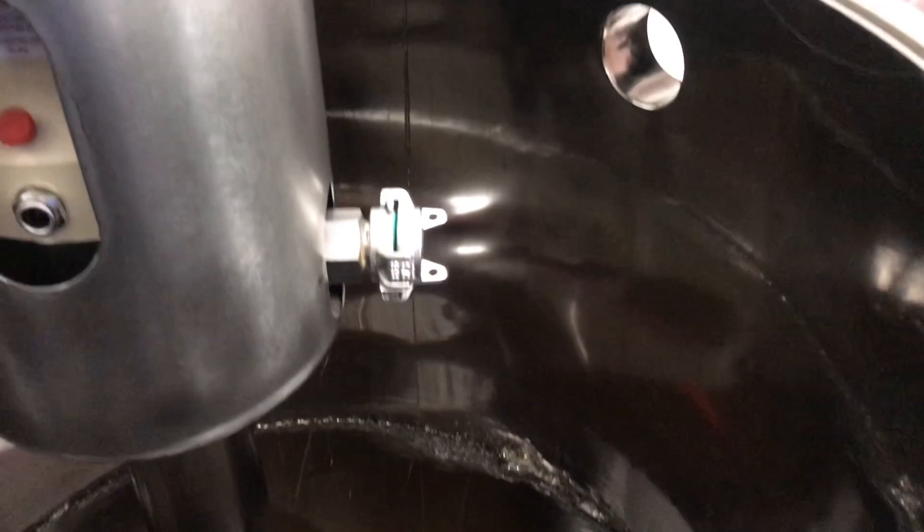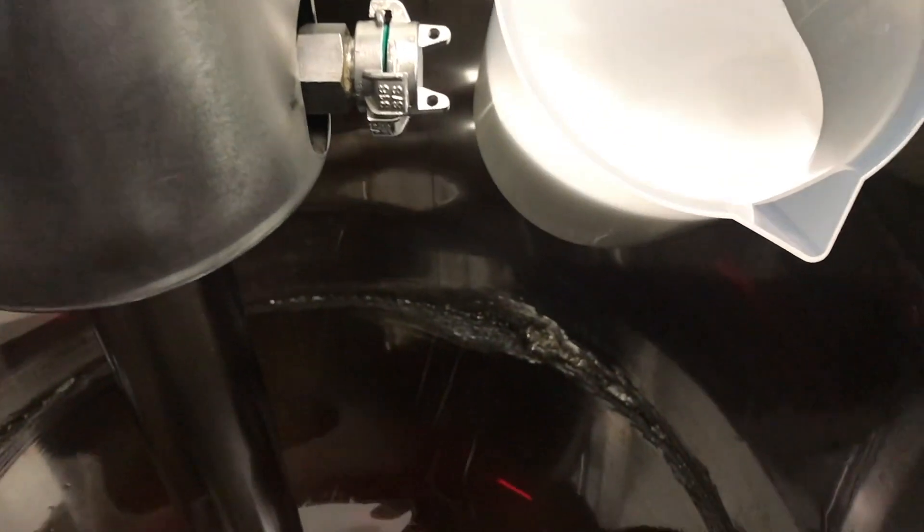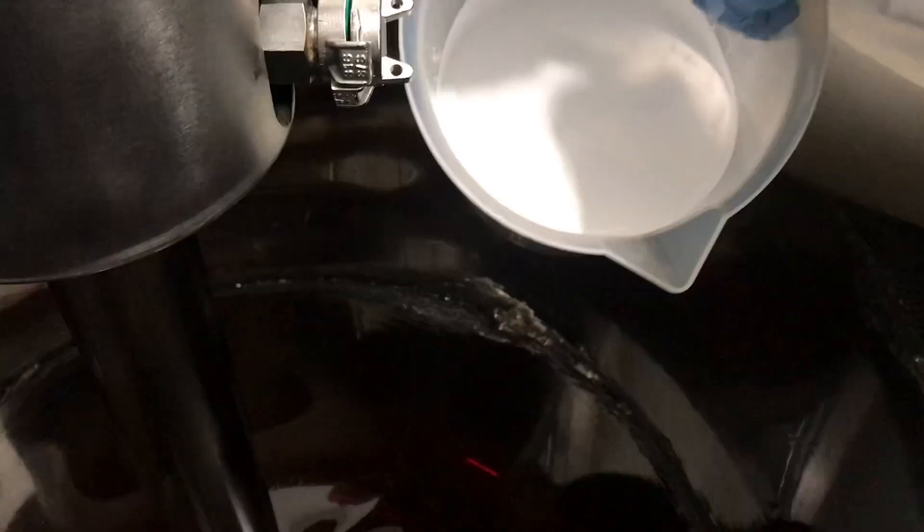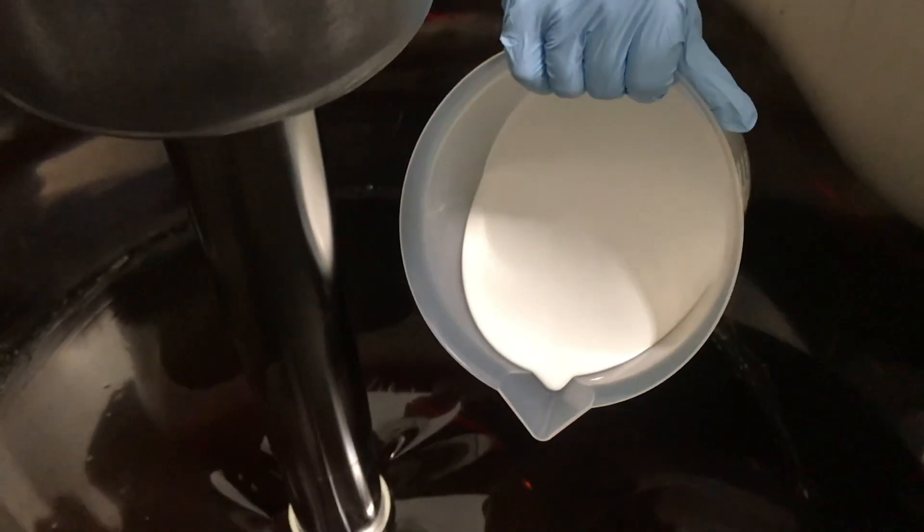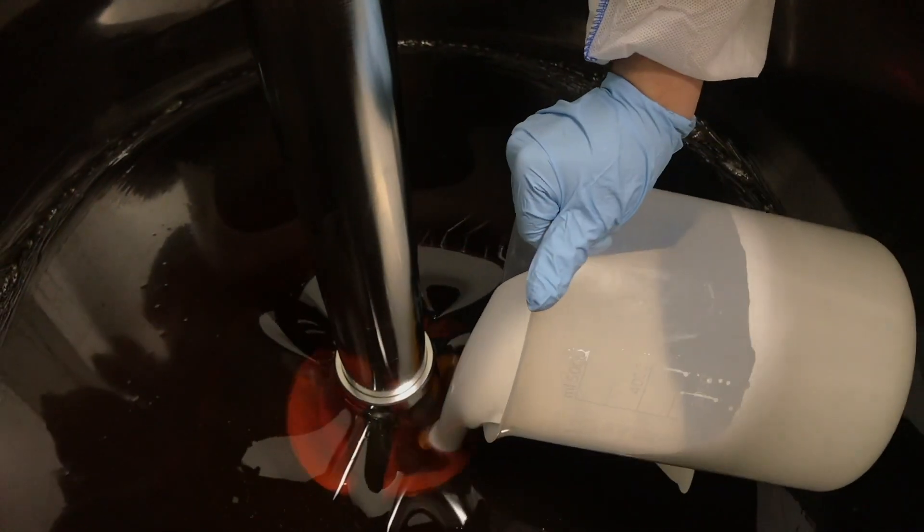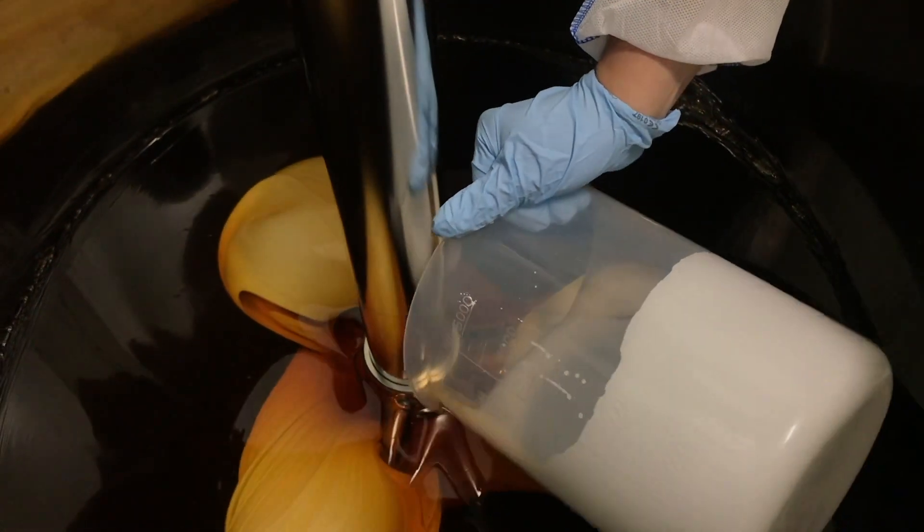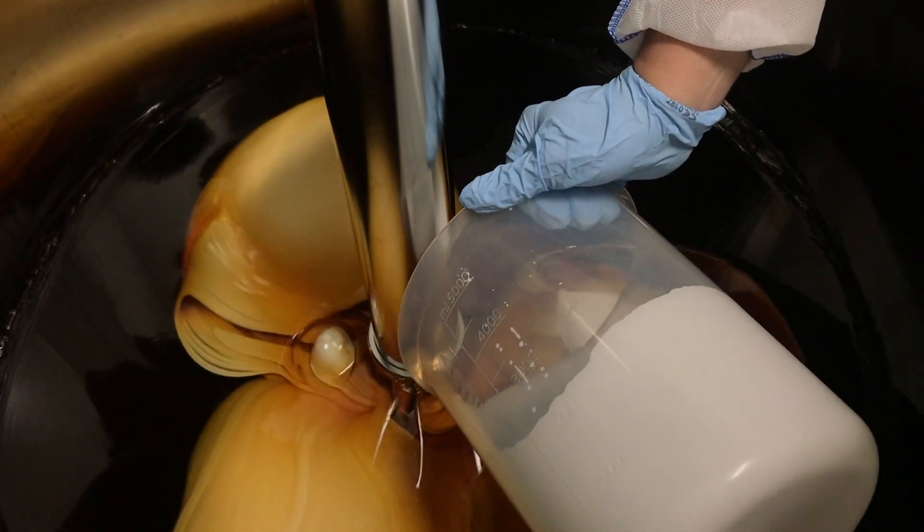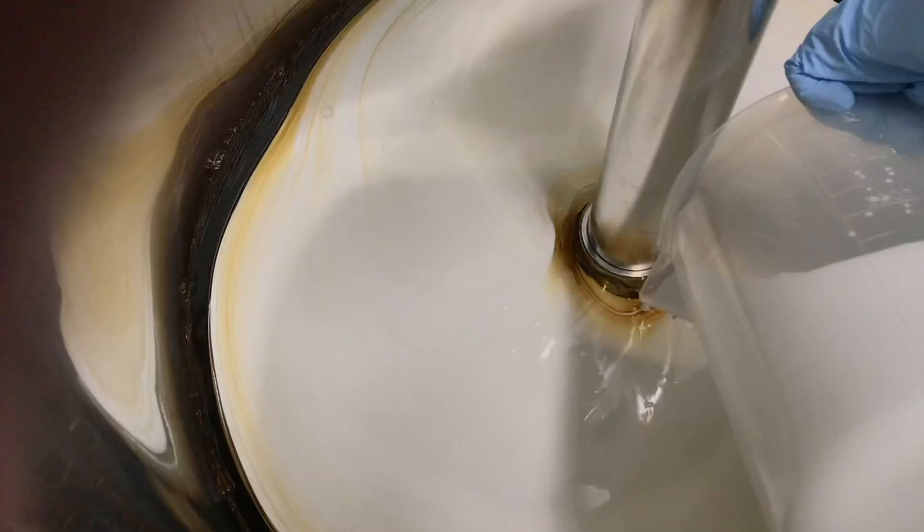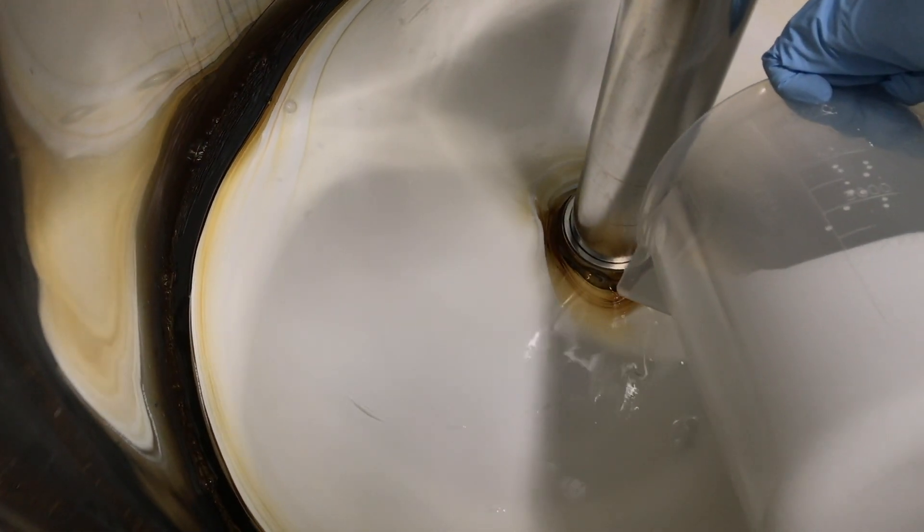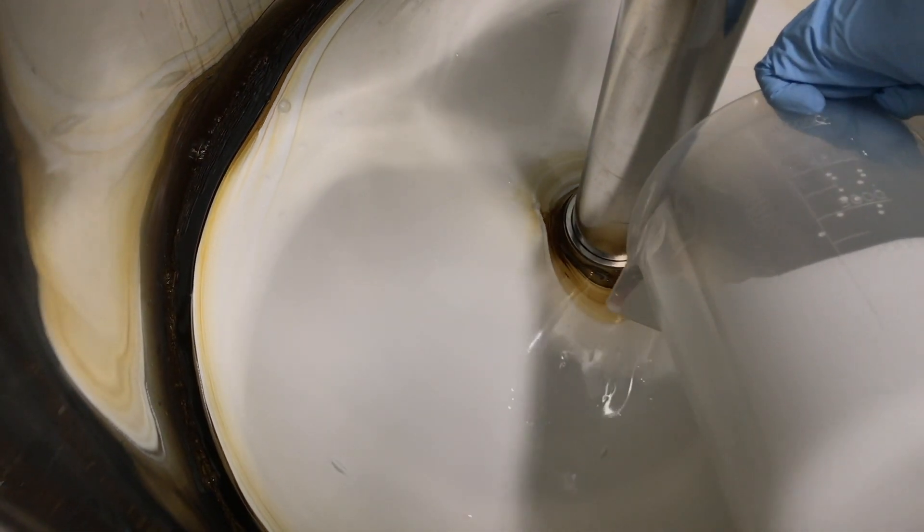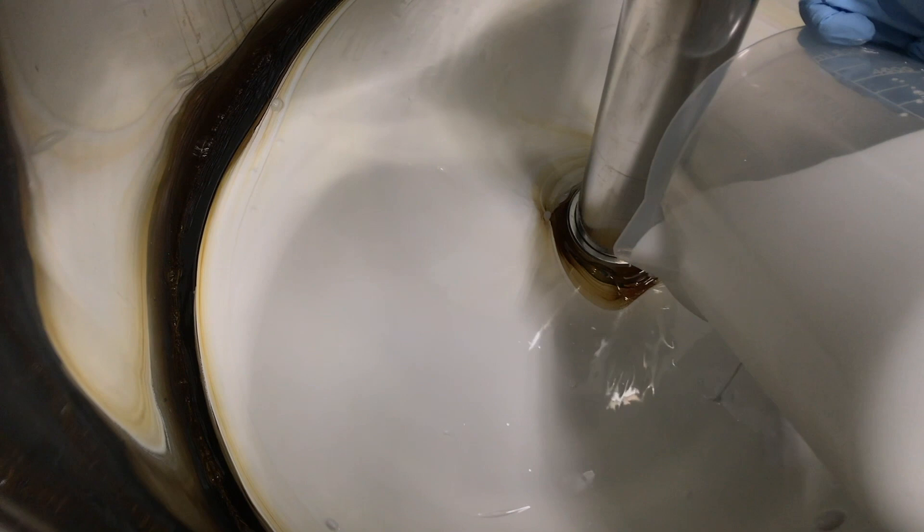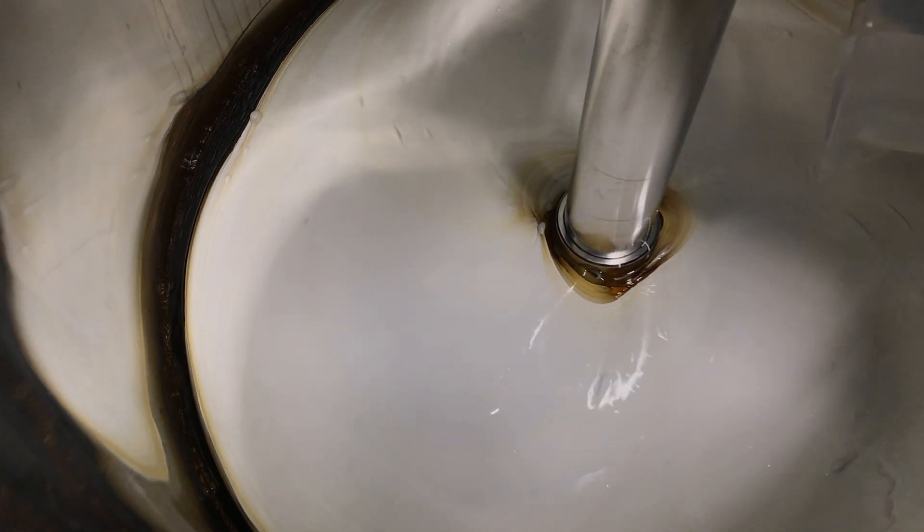Now in this step the colorant is added. Specifically, this is a mix of glycerol with titanium dioxide, and the coloration takes place in the holding tank using a jet stream mixer so that no air is entrapped. This takes anywhere between 15 and 30 minutes.